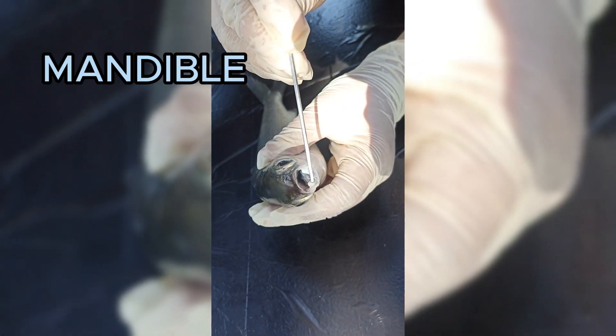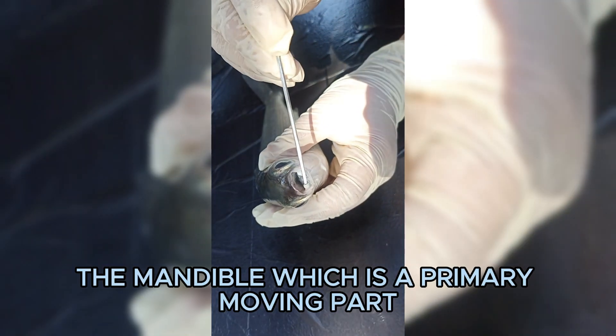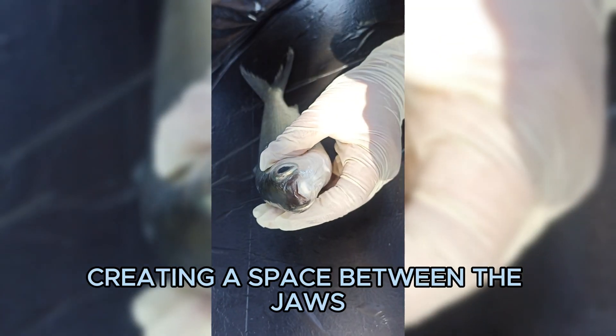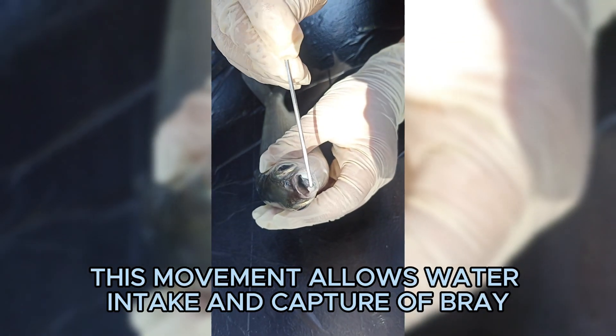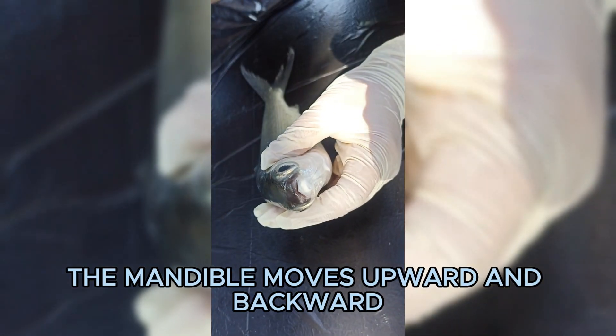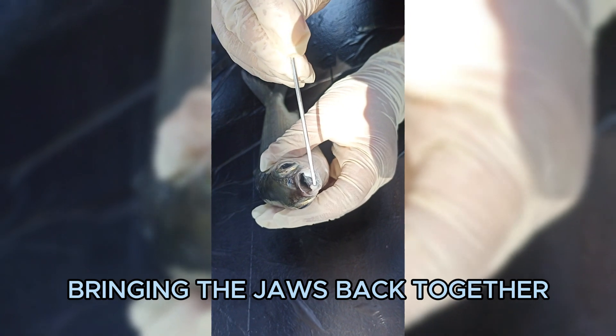Open and close the fish's mouth to observe the actions of the mandible and maxilla. During opening, the mandible, which is the primary moving part, moves downward and forward, creating a space between the jaws. This movement allows water intake and capture of prey. When closing the mouth, the mandible moves upward and backward, bringing the jaws back together.